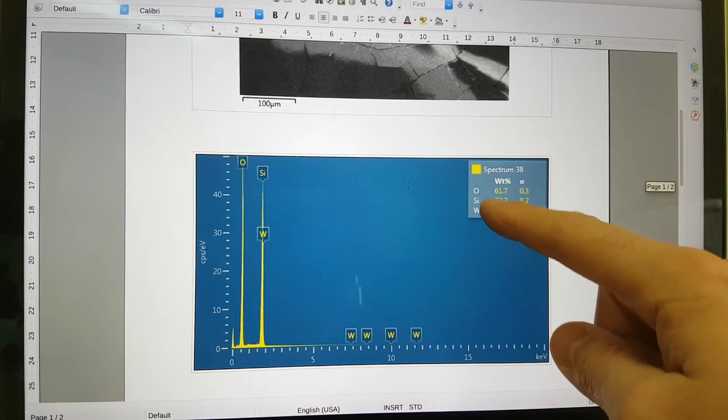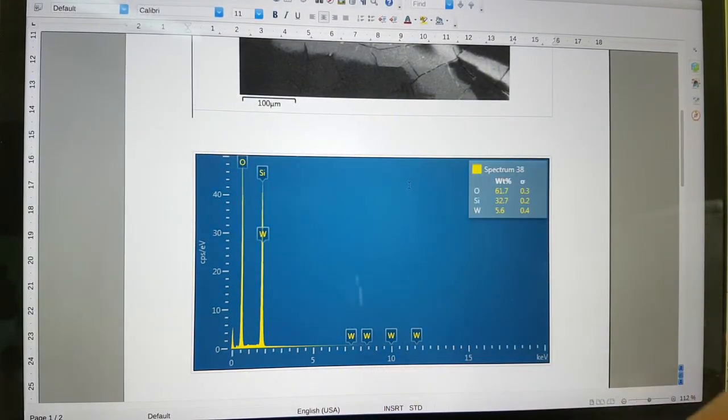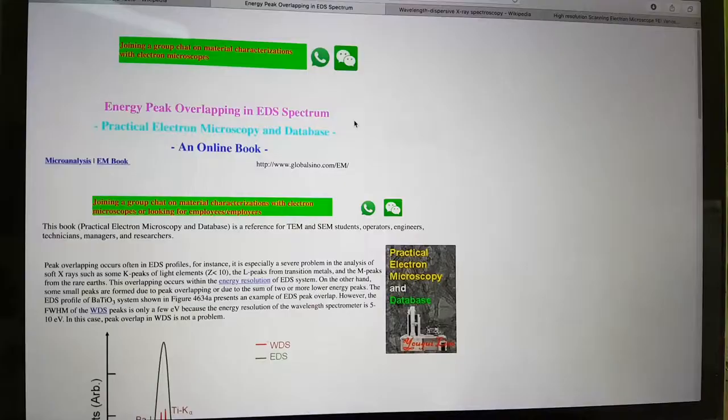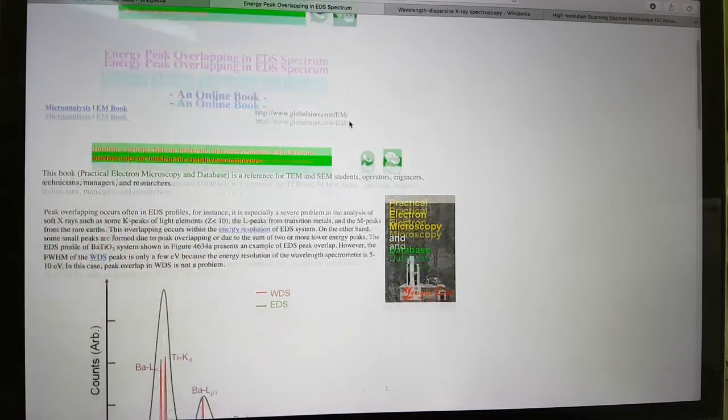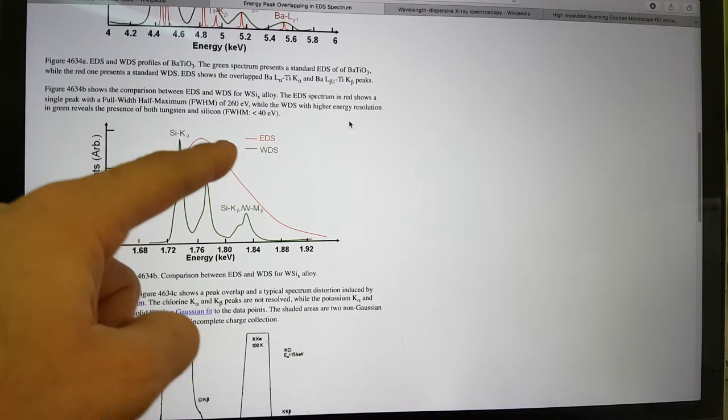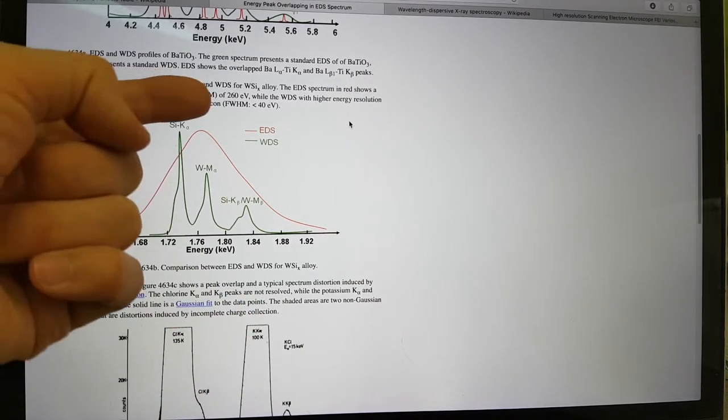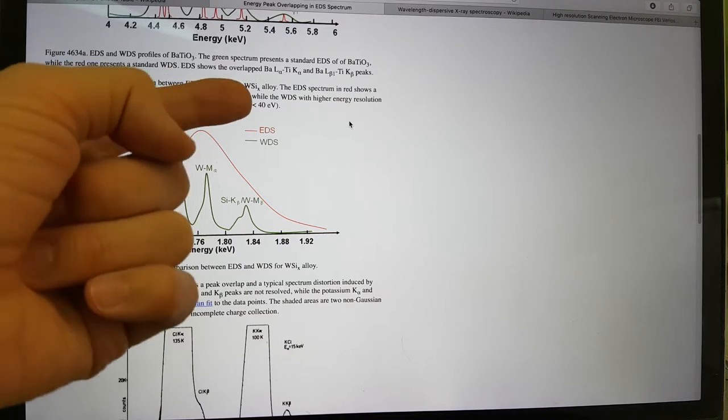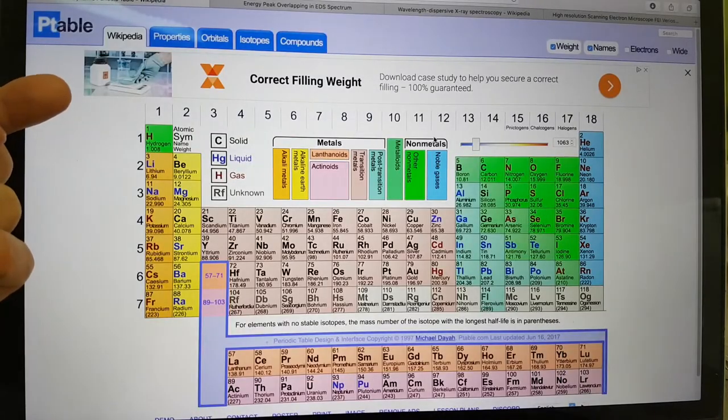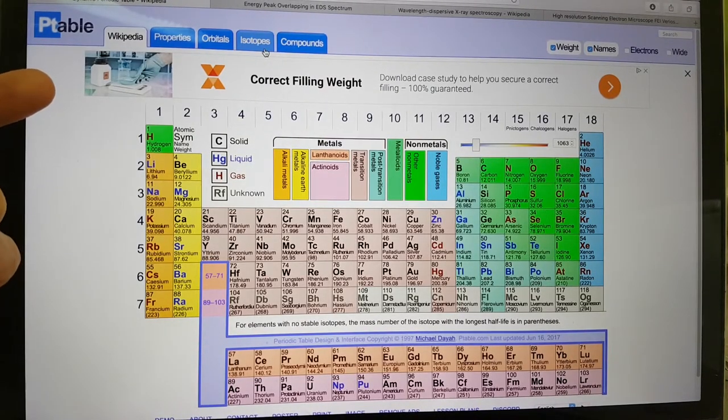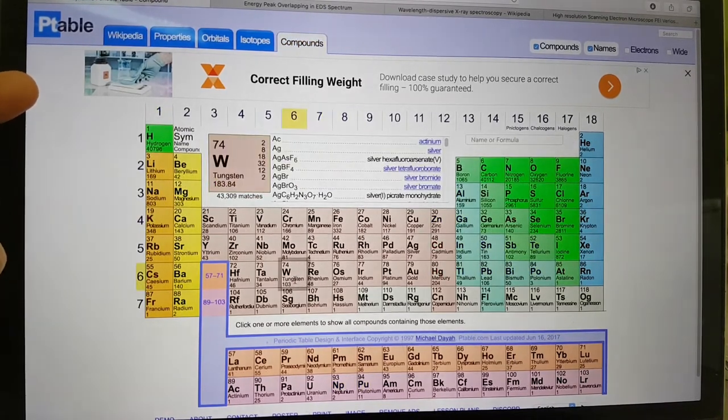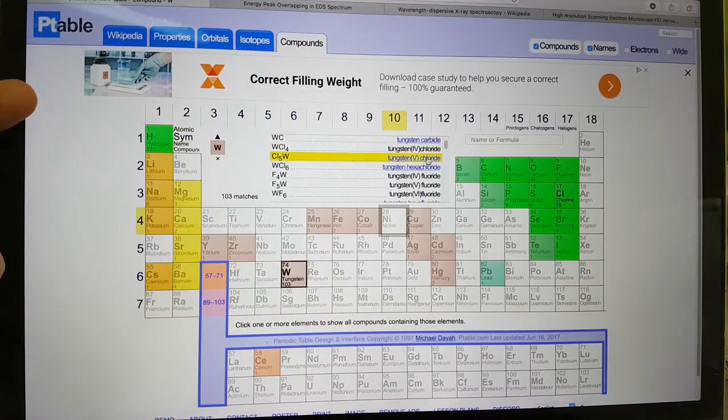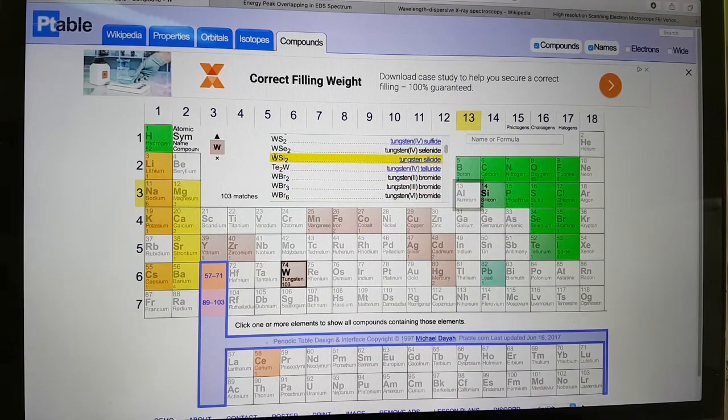And we looked at that. This came out as silicon dioxide, as one would expect. And also there seemed to be this tungsten in here. Now, there's an issue. You can see here the tungsten looks very close to the silicon. So I investigated this some more. And I came up with this page here on the Internet, which is talking about energy peak overlapping in EDS spectrum.